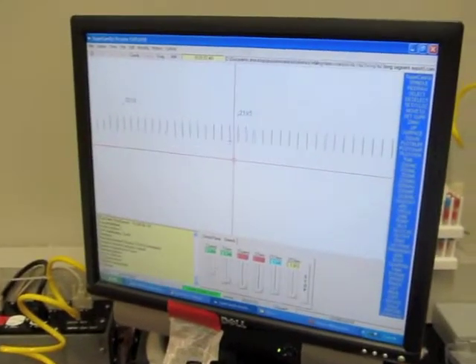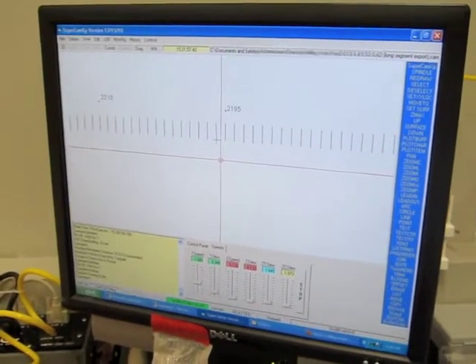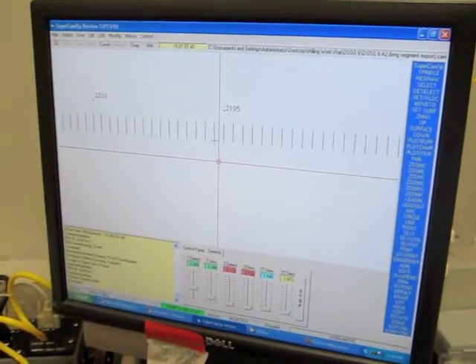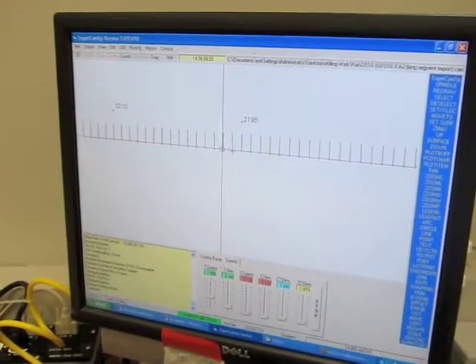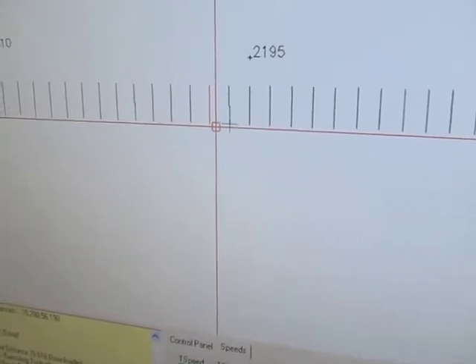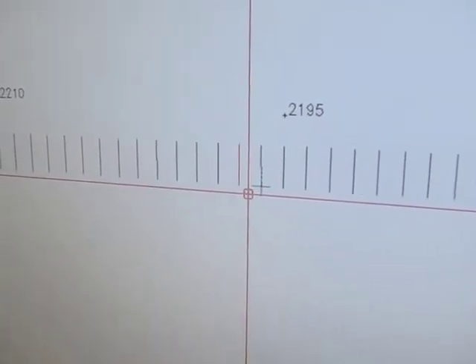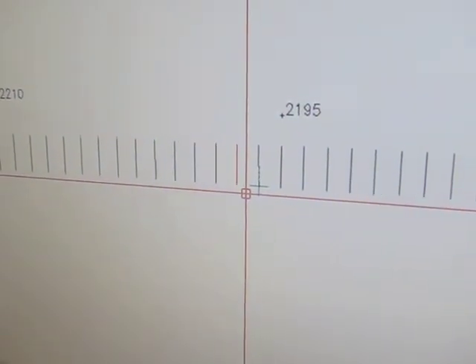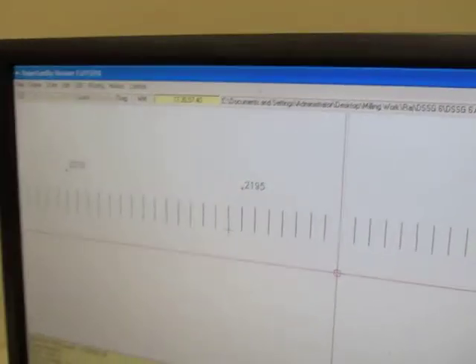This video is going to walk through the entire process of drilling and collecting one sample's worth of material. So the first thing you want to do is select the vector that's going to be drilled. This is pretty easy. Just click it and you'll see that it changes from black to red on the screen here. Once you have that vector highlighted, you're going to go to the right hand side of the screen and choose Plot Item in the vertical blue box.